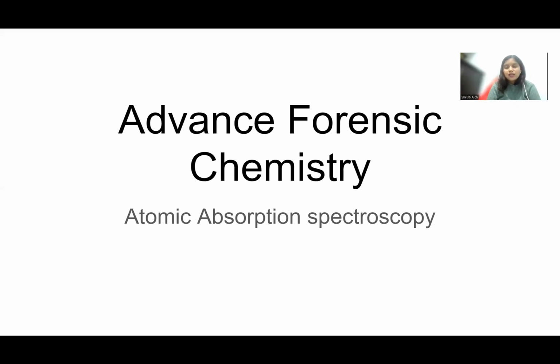Of course, there are n number of techniques. For example, if you want to check the quality of gold, gold may be adulterated with copper or some other metals, silver and so on. We have n number of chemical reactions which we can do to identify which type of adulterant is present. But we can only identify which type of element is present. That is qualitative analysis.